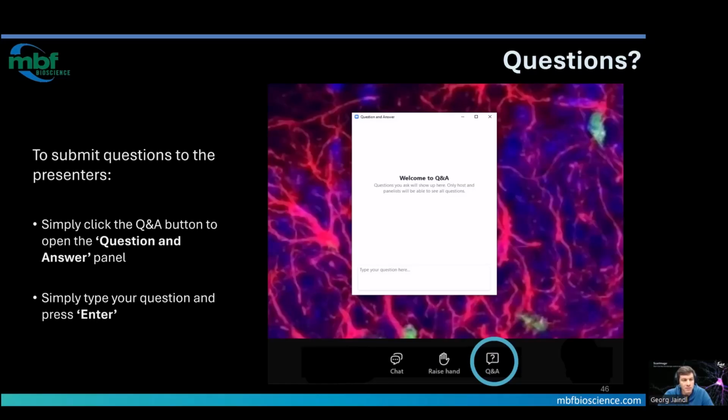By default, ScanImage does not accept commands over TCP/IP to start, stop, or otherwise control the acquisition. That being said, we have some other projects where we have implemented functionality like that. And if you're interested in that, please reach out to support and we can get you up and started with that.